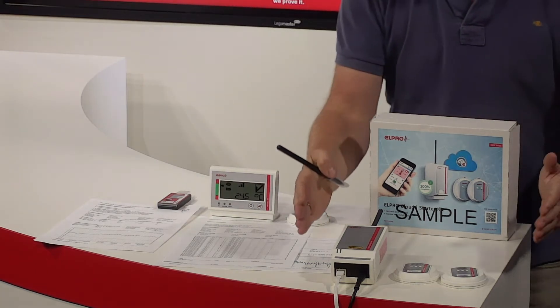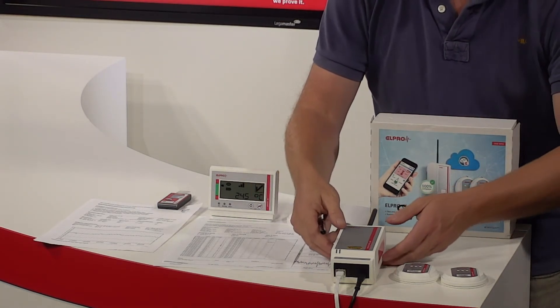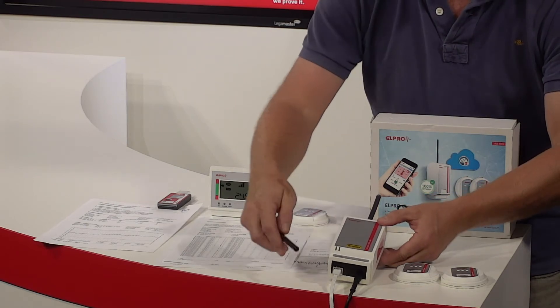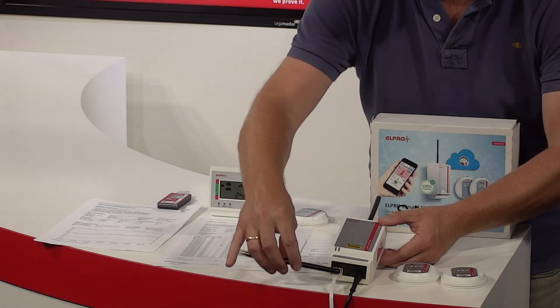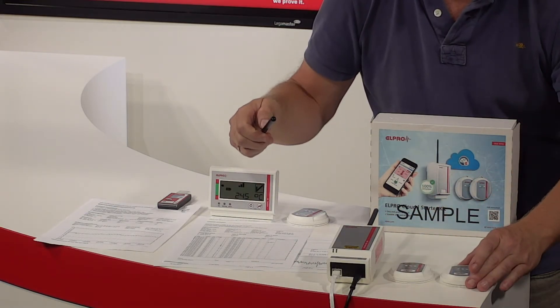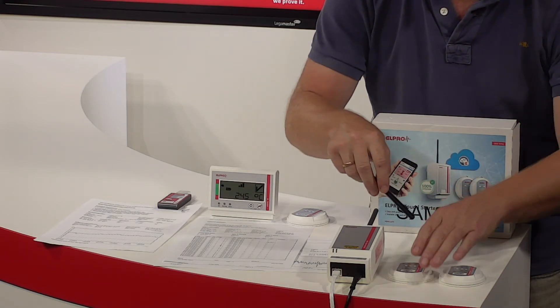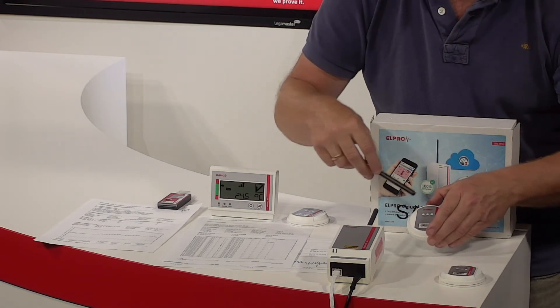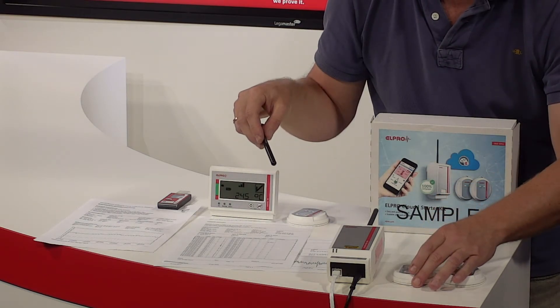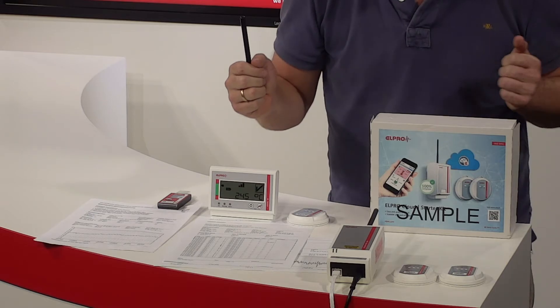Here we have the cloud solution — the starter kit. It's a wireless bridge connected to the internet with alarm and powered with a cable. There are two wireless sensors here. They buffer the values and send them wirelessly via the bridge to the cloud. The alarming takes place inside the cloud.